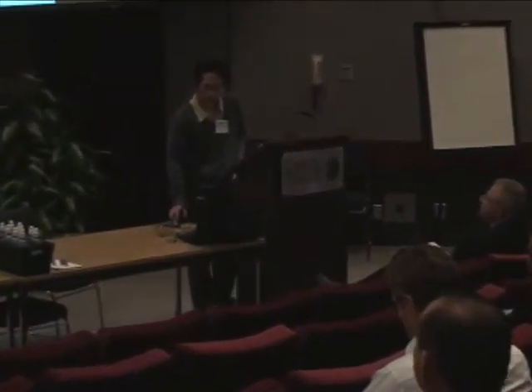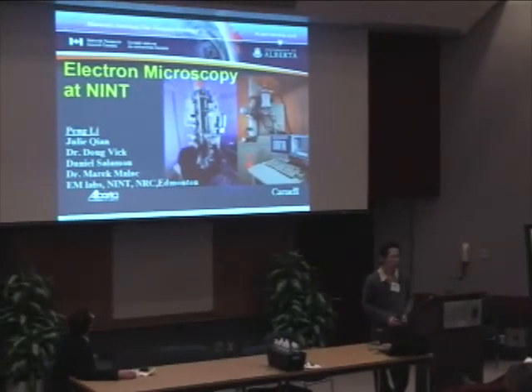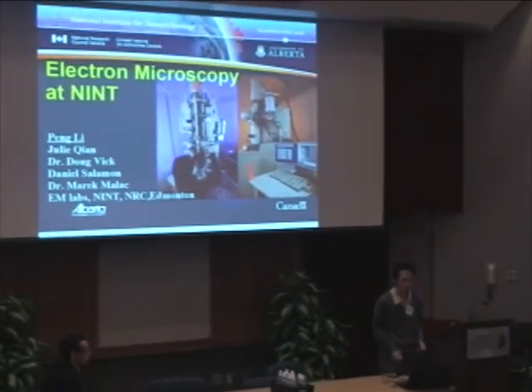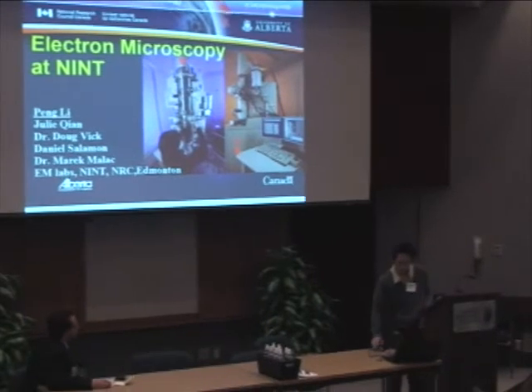We are a new electron microscopy facility at NINT. We are not really directly related to any clean technique, but here we'll just introduce ourselves, our facility and the general capability, how to characterize and analyze your nanomaterials and nano devices, and also some of the fabrication capability.